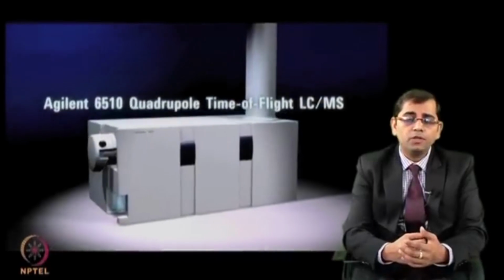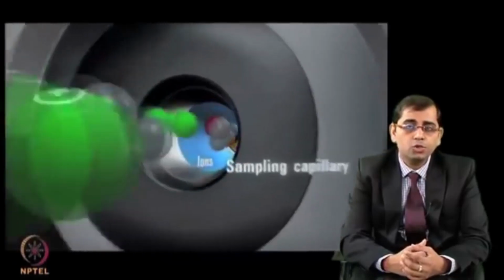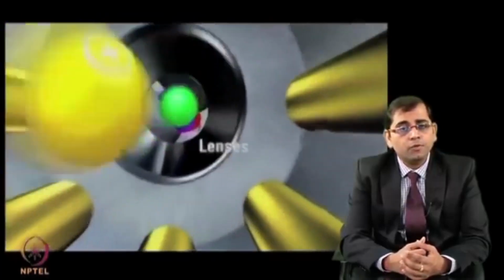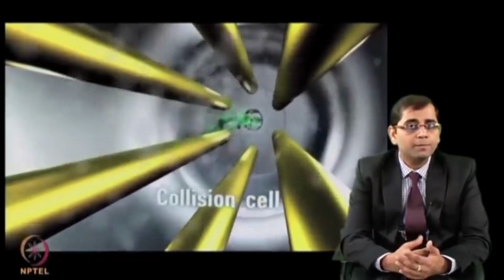Lectures 11 and 12 will cover hybrid MS-MS configurations as well as a discussion on two latest hybrid MS technologies, QTOF and Orbitrap. The basics of quantitative proteomic analysis and the different types of quantitation methods that exist in the literature using mass spectrometry will be discussed. In lecture 13, we'll talk about quantitative proteomic analysis using stable isotope labeling by amino acids in cell culture, or SILAC.